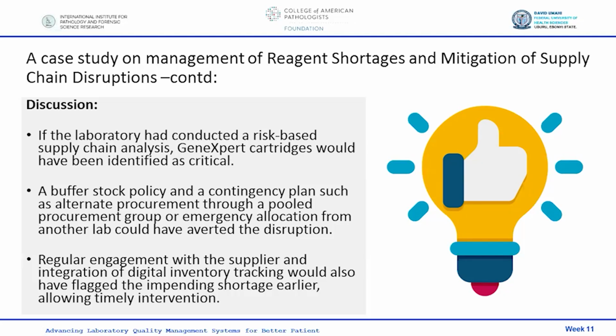Regular engagement with the supplier and integration of digital inventory tracking would also have flagged the impending shortage early, allowing timely intervention.